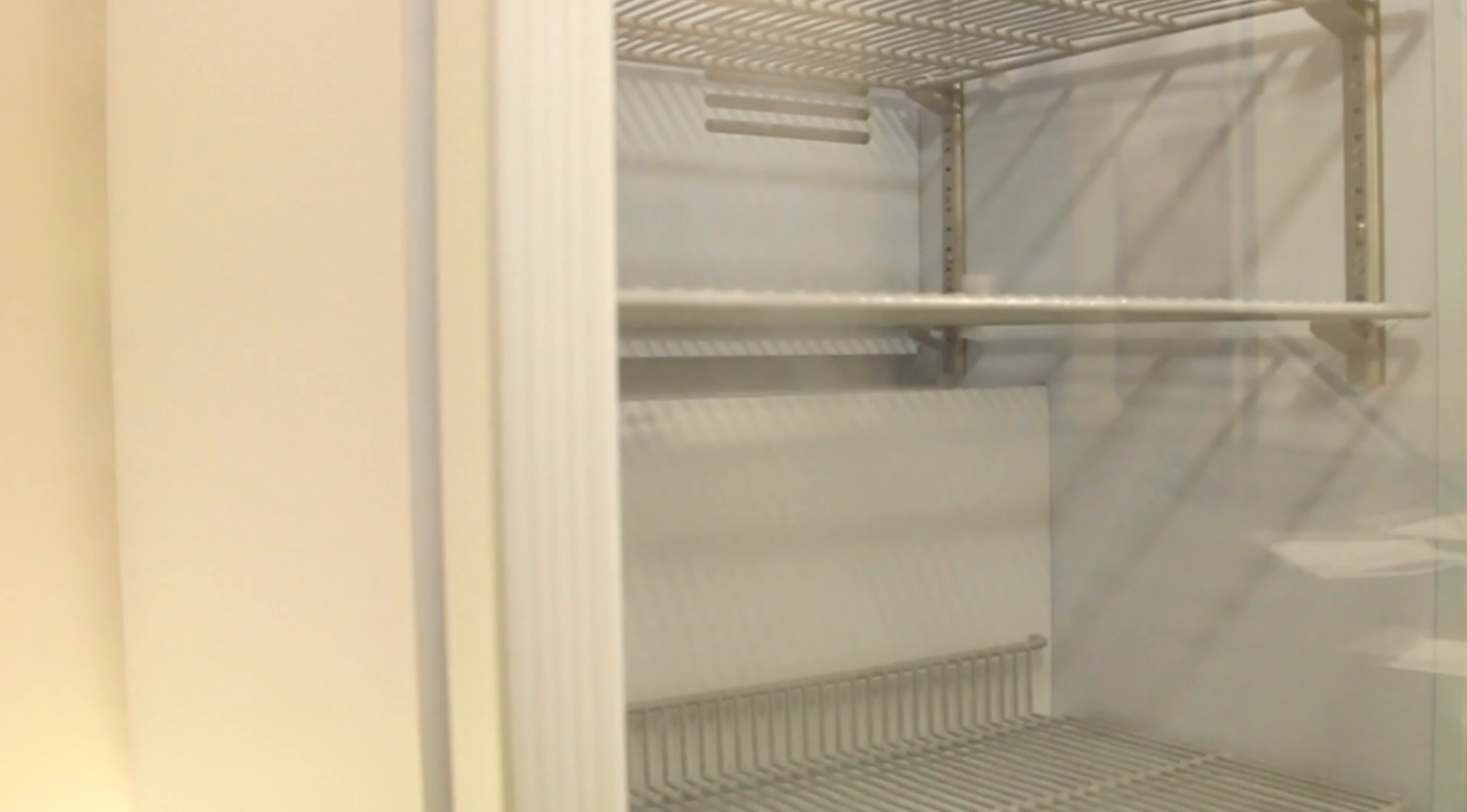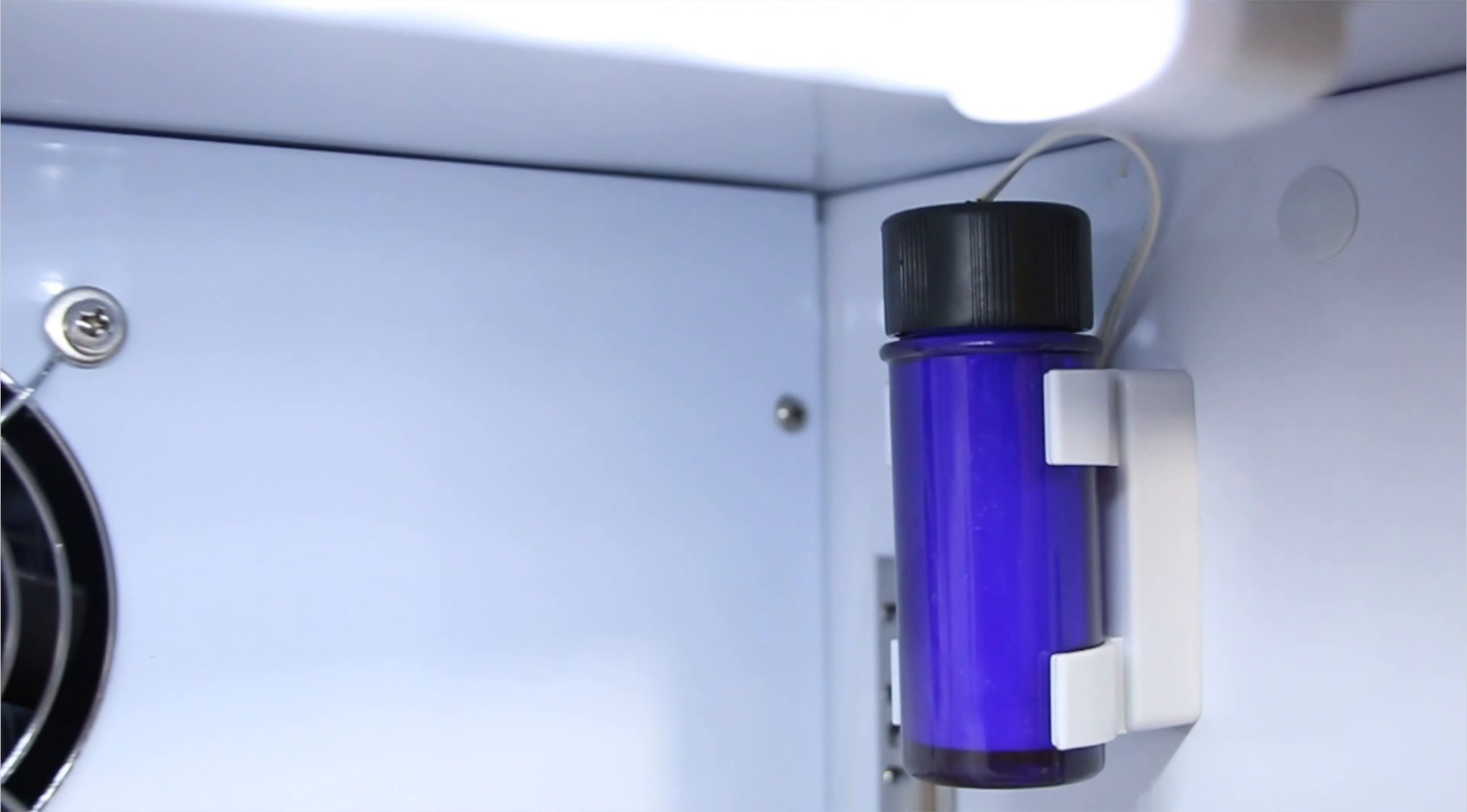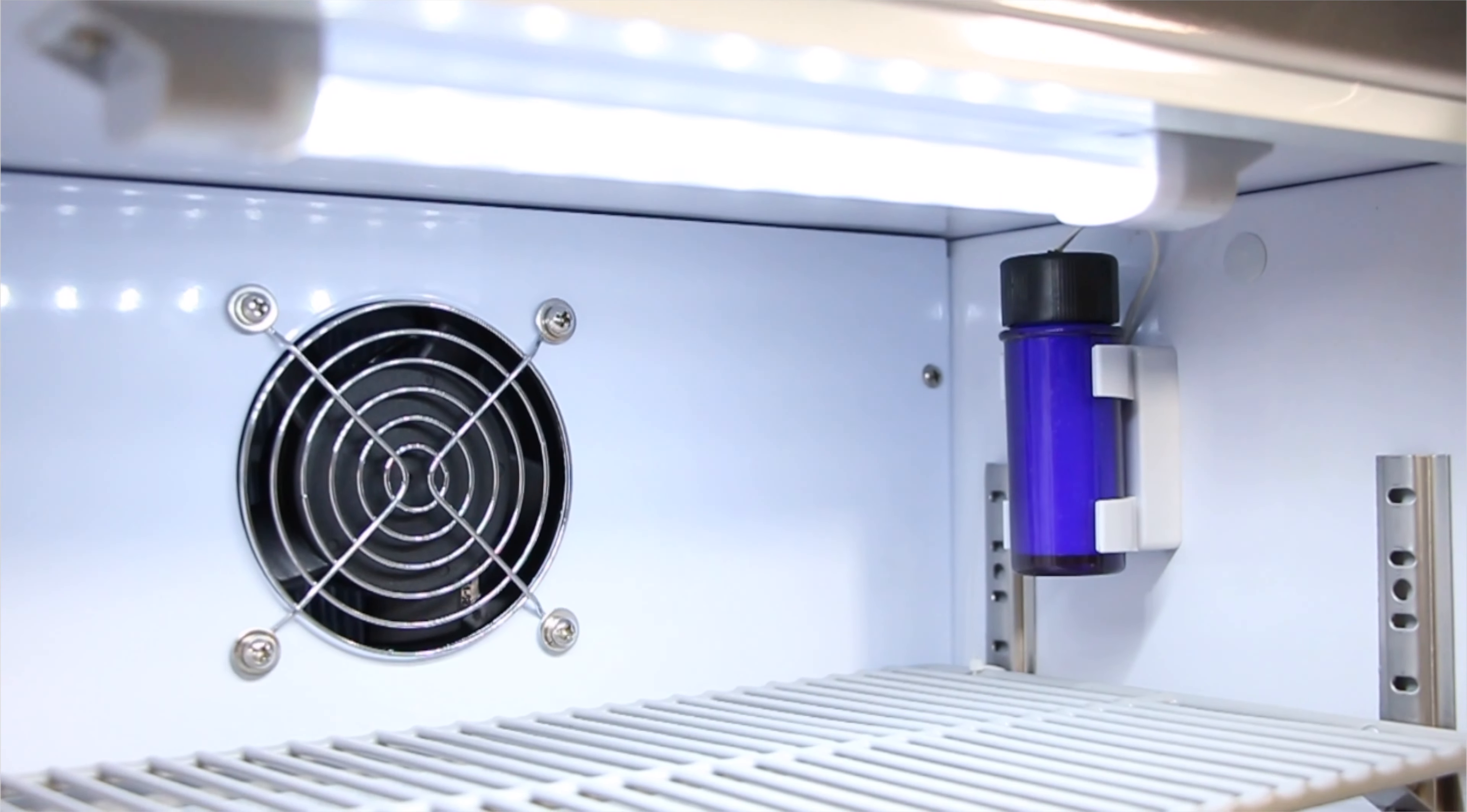This model has two wheels positioned at the back of the fridge so it can be easily moved when needed. This fridge features a high-quality built-in temperature probe which accurately monitors and stabilizes drug temperatures.